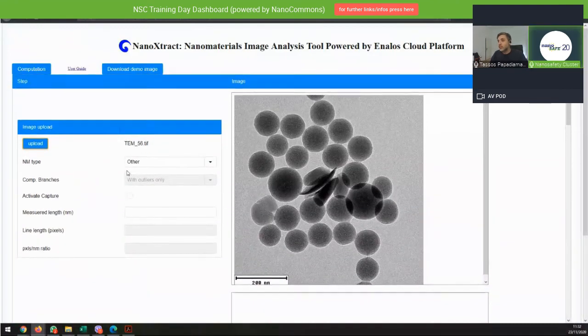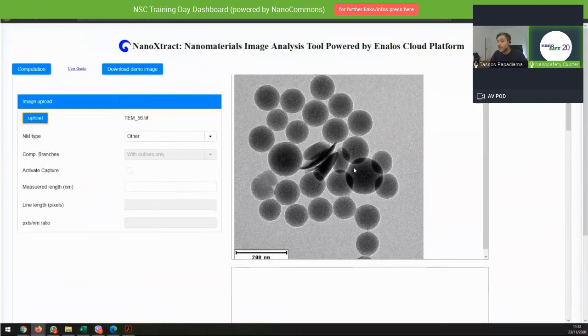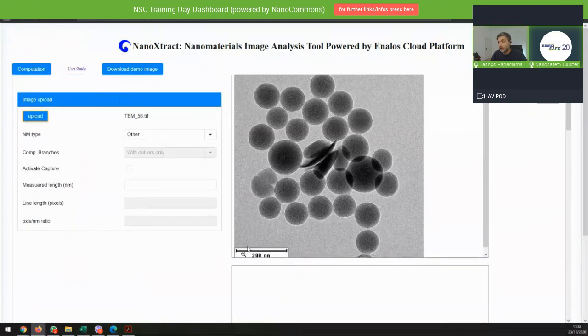Okay. So let's say here you see that although it's theoretically a very clean image, you have a strong contrast in the scale bar, but you also have these nanomaterials here that apparently decided to sit their own way. You have overlapping here and so on. So I've not been able to work very deeply on that, but I have an idea of how this should look.